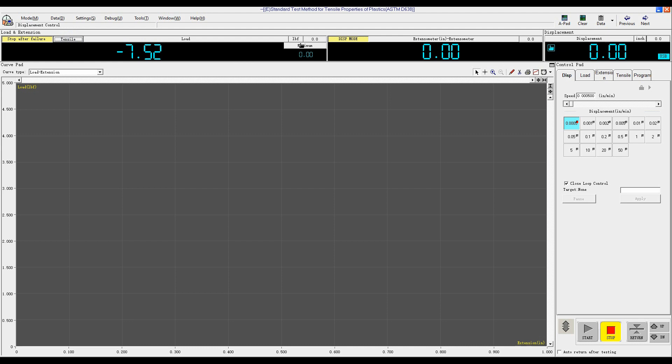The unit is LBF inch. Before test, click Clear to zero load, extension, and displacement.